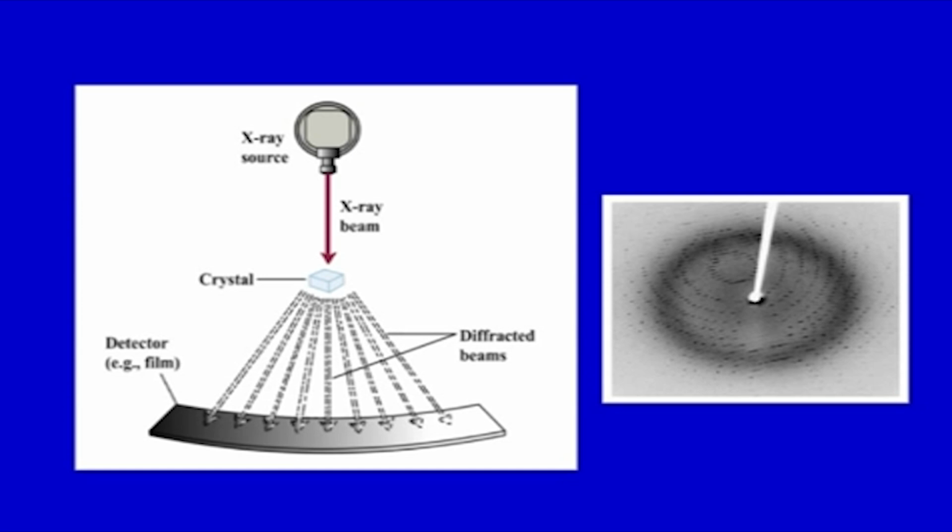Now, if you can see, this is the center, and as you go to the periphery, there is more diffraction towards this side, and more resolution, that is, we get higher resolution. If we say 1 angstrom resolution, then it is higher resolution. If we get 2 angstrom or 3 angstrom, then it is a lower resolution. Depending on how much information, that is, if 2 closely spaced atoms can be resolved, then it is higher resolution, and it is obtained when there is higher reflection or diffraction at higher angle.